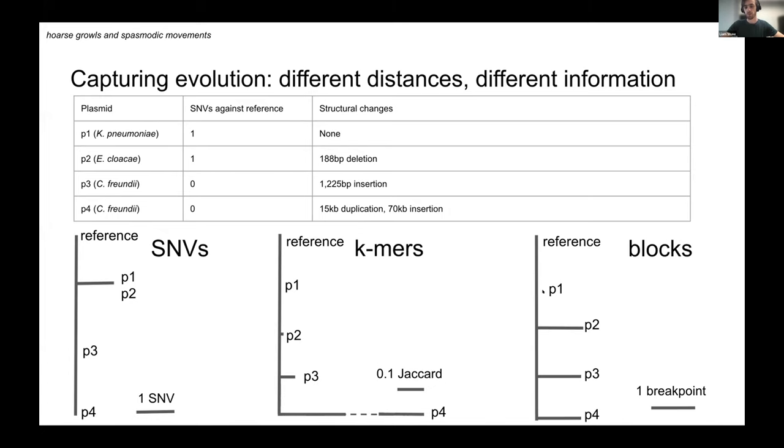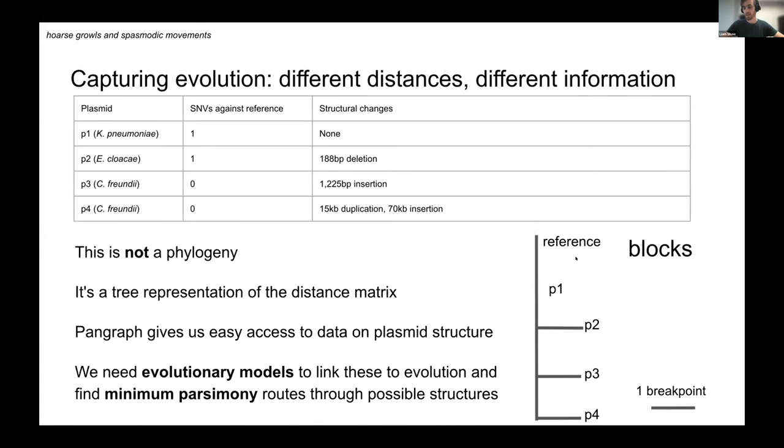And now here we're using blocks and the breakpoint distance. P1 is the same as the reference. All of the other things have one breakpoint with respect to P1 and two with respect to each. So this is not a phylogeny. It's a tree representation of the distance matrix. This is very easy to get out of PANGRAPH. We get really easy access to data on the plasmid structure, but what we need is evolutionary models to link those distances to evolution and find minimum parsimony routes. We might want to decouple this one breakpoint into two different things, but we need a model of evolution to do that. So far, we're just saying every breakpoint is the same.